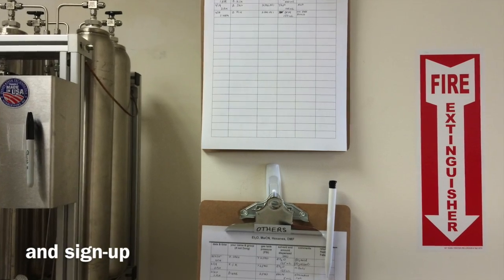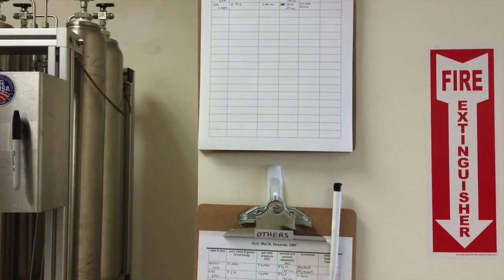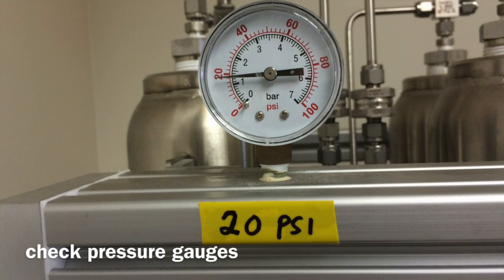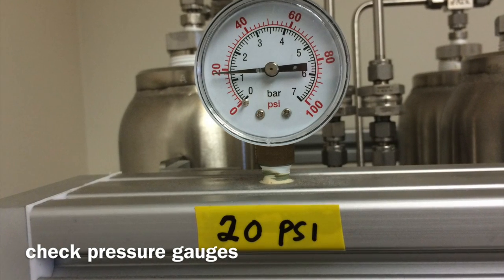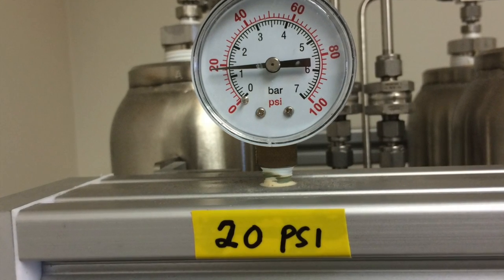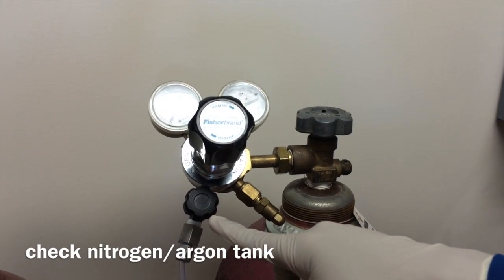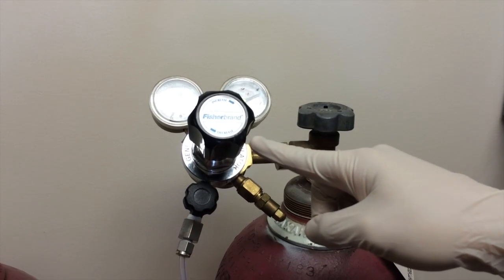Always sign up to use the SPS and indicate the solvent that you will be dispensing. After signing in, check the gauges to make sure there's sufficient pressure. The manifold gauge should be set at 20 psi. You'll only need to adjust the gas tank if the pressure on the manifold is below 20 psi.